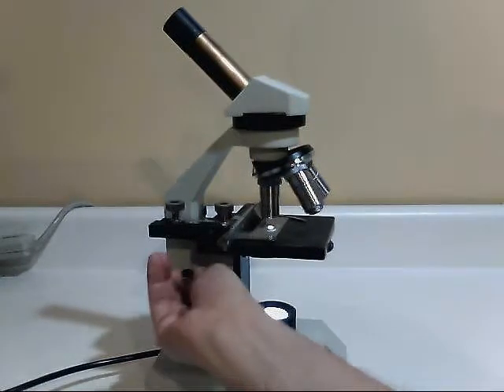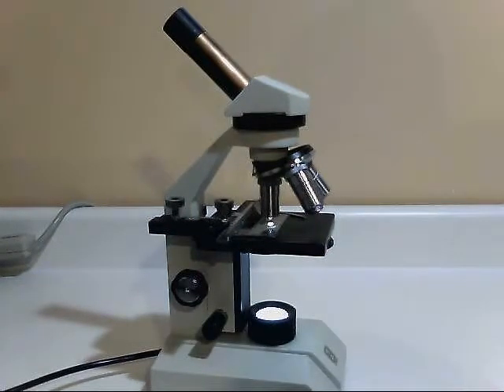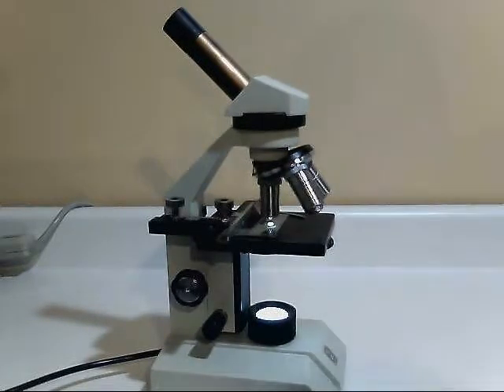Again, we bring our slide tray all the way up and we focus down from there. In our next little piece, I'm going to try to hold the webcam carefully and look through the objective lens to see the sample of our newsprint that we just made.